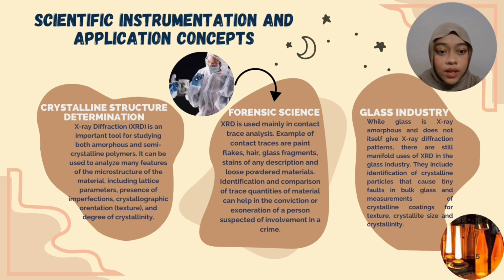While glass is X-ray amorphous and does not itself give X-ray diffraction patterns, there are still manifold uses of XRD in the glass industry. They include identification of crystalline particles that cause tiny faults in bulk glass and measurements of crystalline coatings for texture, crystallite size, and crystallinity.